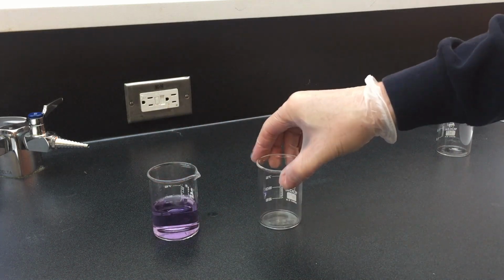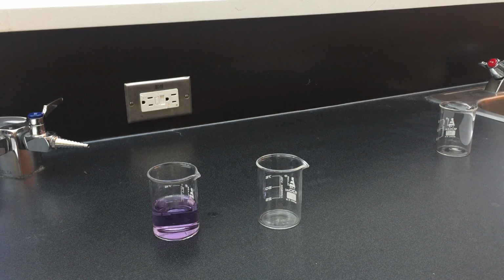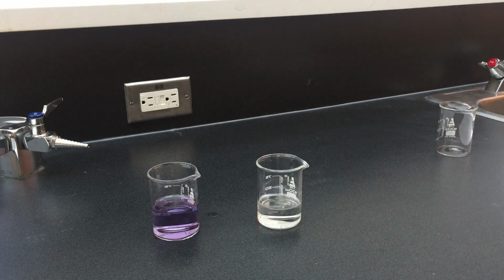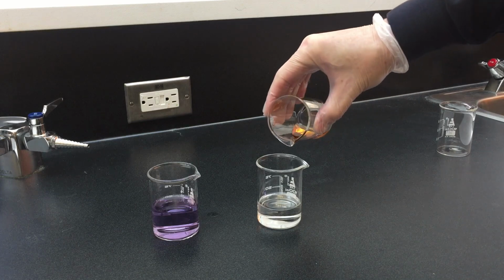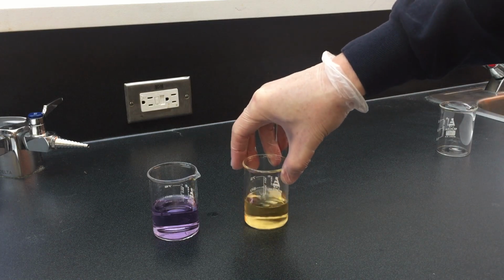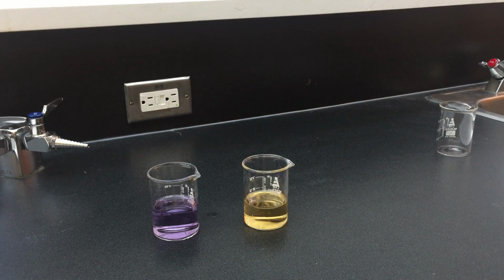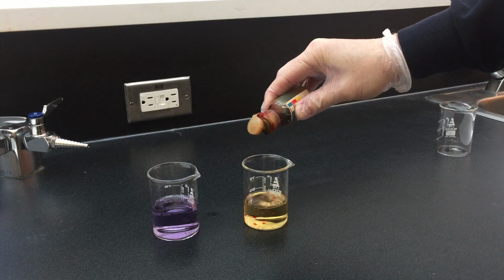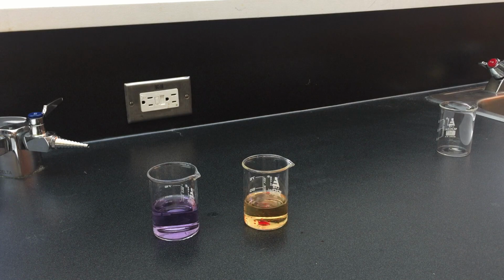In my second beaker, I am going to take, again, some cyclohexane solvent and put in a very little bit of sebacoyl chloride, which is an acid chloride. It dissolves well in the organic, and this will produce a very acidic, strongly acidic solution, as is indicated by the universal indicator turning red.